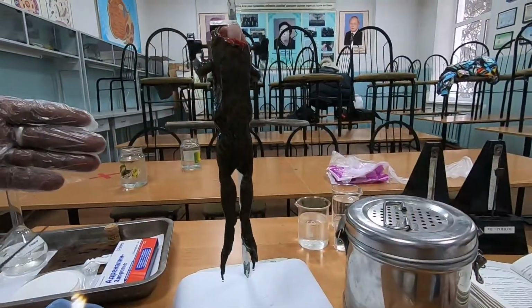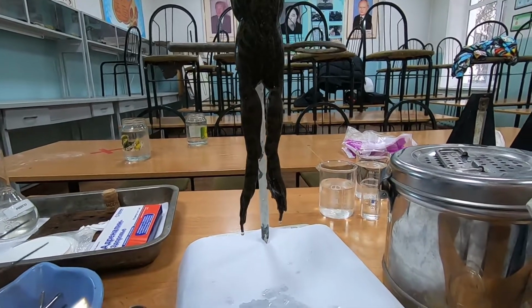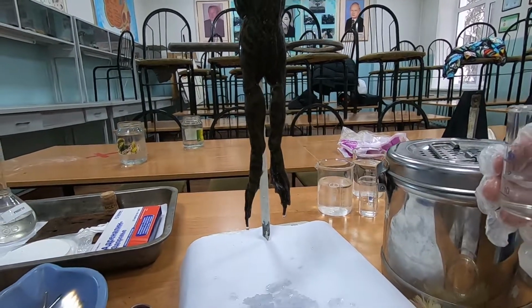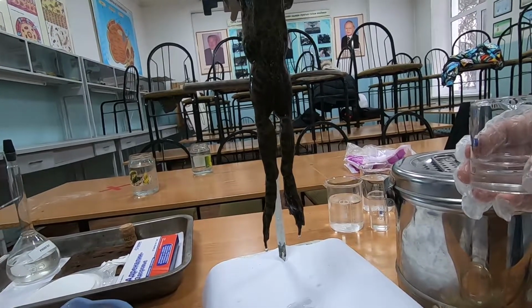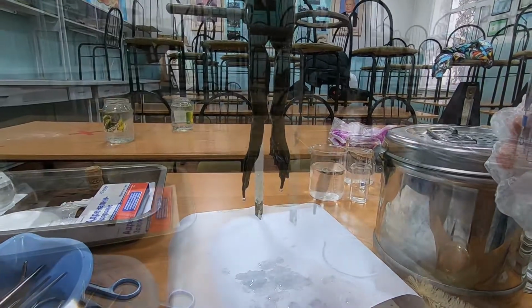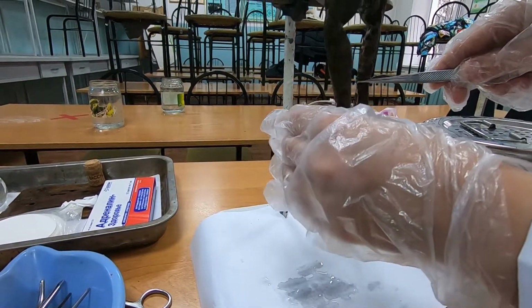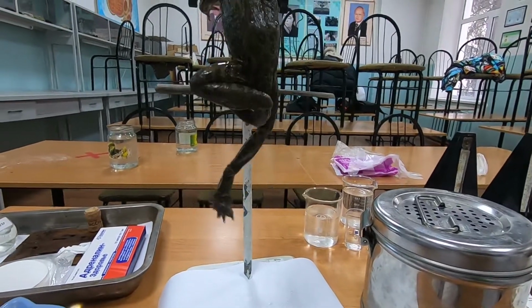We're going to repeat the same experiment using a more concentrated, almost twice, sulfuric acid, 1%. We used 0.5, and now we're going to use 1%. You will see the difference. Okay, you can see the immediate reaction.